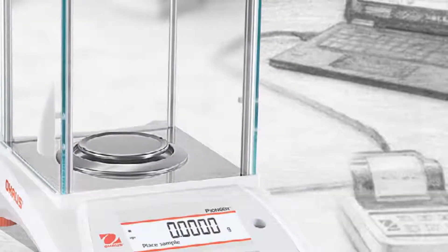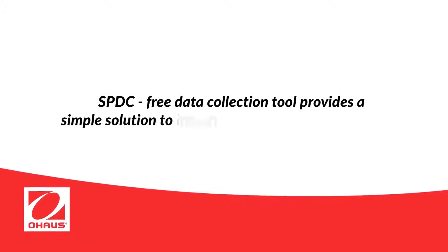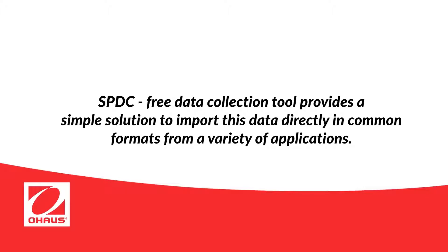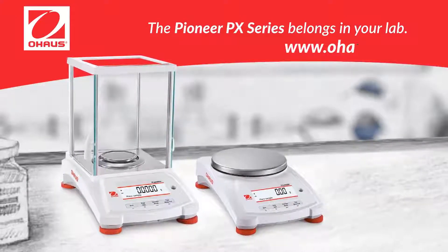Ohaus's free data collection tool, SPDC, provides a simple solution to import this data directly in common formats from a variety of applications. The Pioneer PX Series belongs in your lab. To learn more, visit us at ohaus.com.